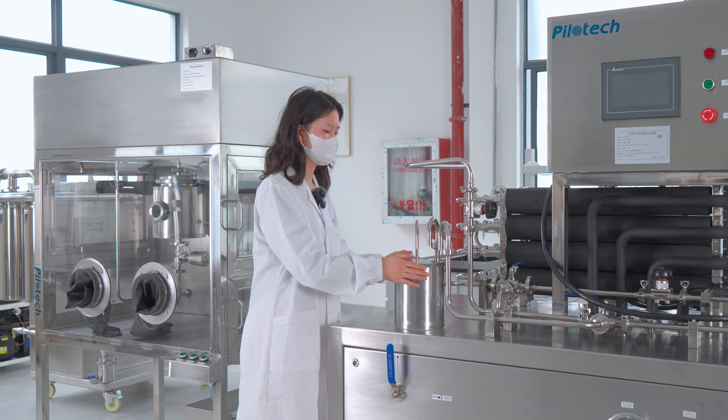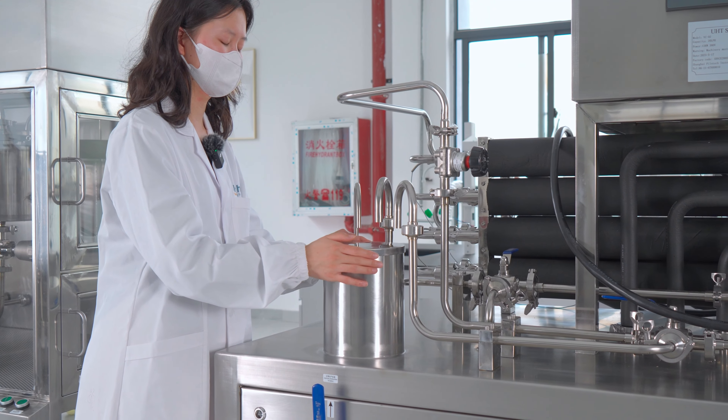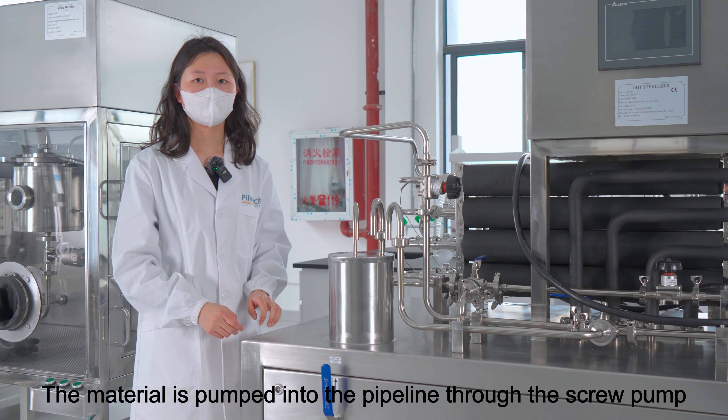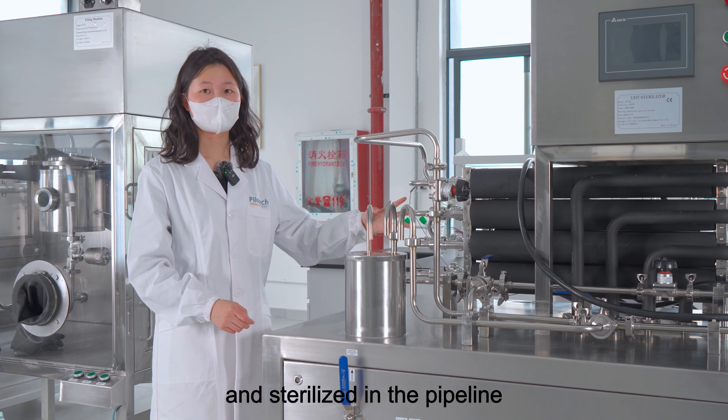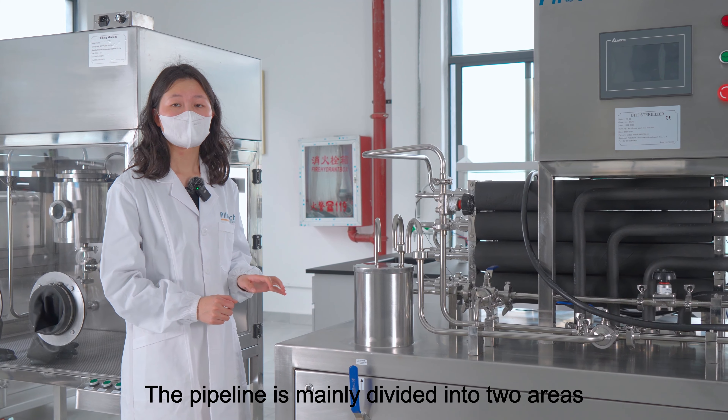This is the hopper and the material is put in from here. The material is pumped into the pipeline through the pump and sterilized in the pipeline. The pipeline is mainly divided into two areas.